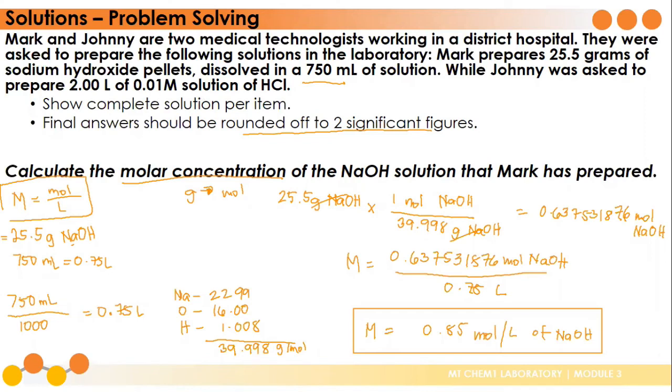And then you can double check the units of measurement. For the first one, we have grams. And then for the second one, we have ml, which does not follow the formula to use. So what you're going to do is convert it. Starting first with our ml, simply dividing it by 1,000, and then you're going to get 0.75 liters. And then you proceed with converting these grams to moles. To convert it from grams to moles, you need to get the molar mass.